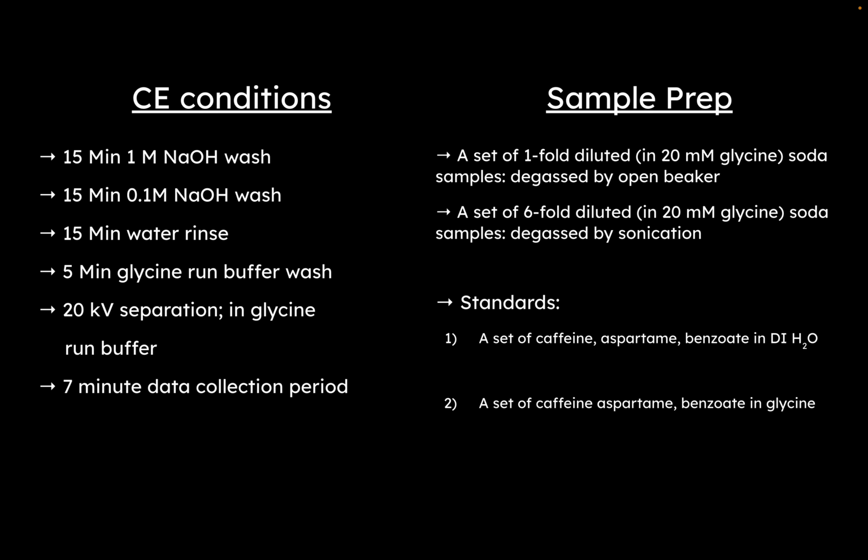And it was a 5-minute collection period that they said in the paper, but I bumped it up to 7 just so I can see the full picture. I let it run overnight, so it was no biggie of a time constraint. But yeah. Okay, sample prep.